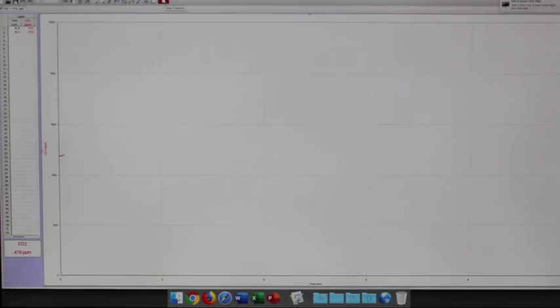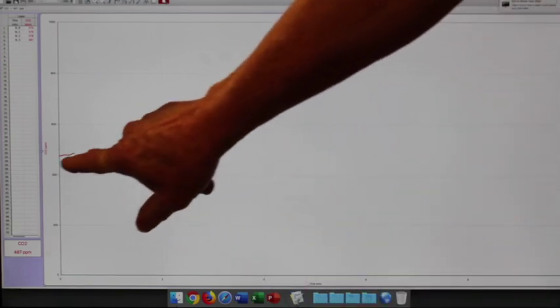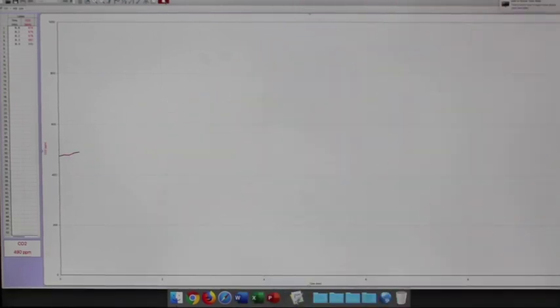Okay, here's our line. If our crickets are going through respiration, should we have an increase in CO2 or a decrease in CO2? Respiration puts out CO2, and so we should be able to see an increase, and that line is moving up like it should be moving up. And now I'm just going to leave that running for 5 minutes, and then we will come back in 5 minutes.